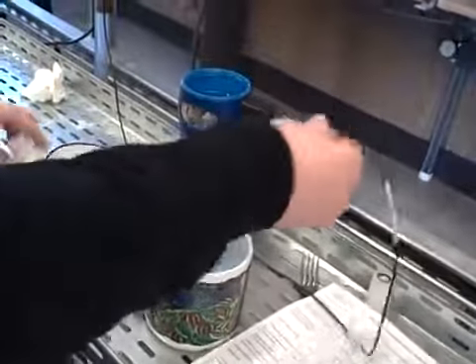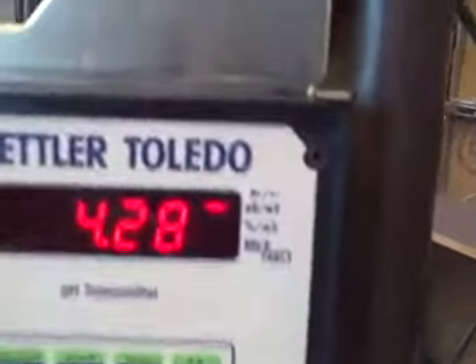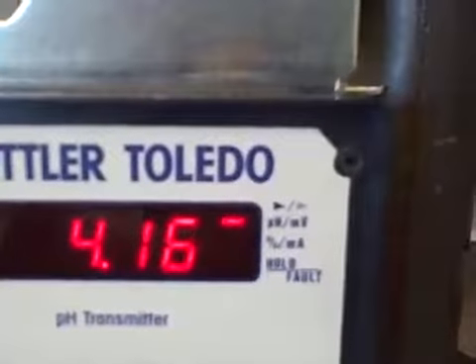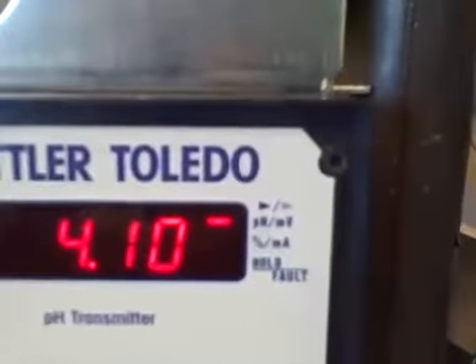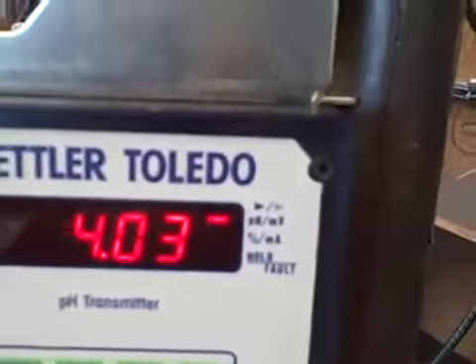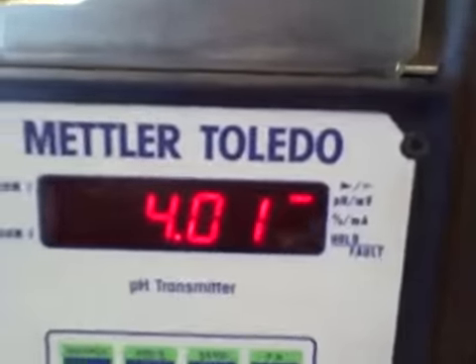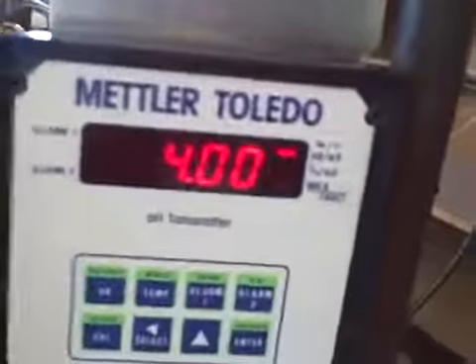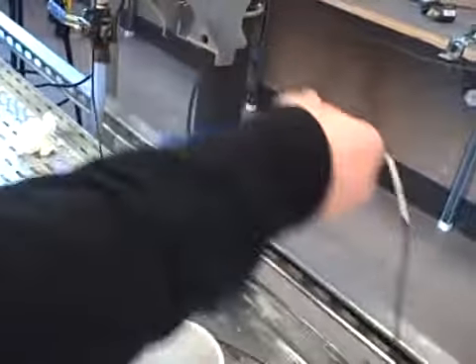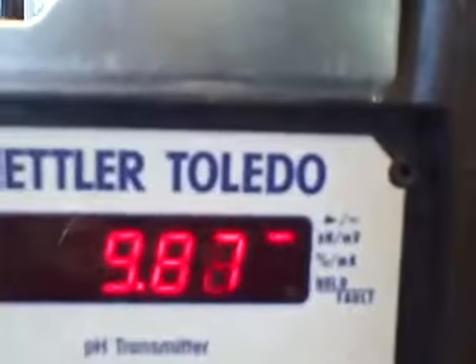I'll test it now. I'll put it back in the pH of 4, and hopefully it registers 4. That's pretty good right there — that's pretty much dead on. We'll clean it off and put it back in the pH of 10, and it zooms right up to 10.